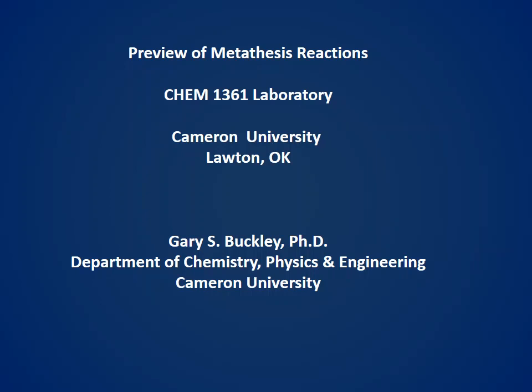Welcome to a short preview of the metathesis reaction experiment coming up. We'll look mostly in this review at things about completing metathesis reactions, double displacement exchange reactions, writing total ionic equations and net ionic equations.